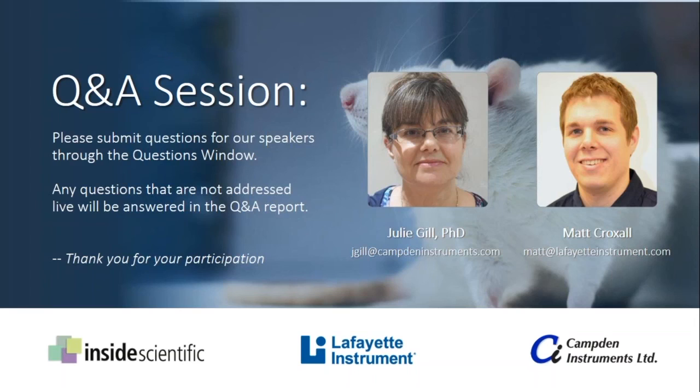Yeah, we've had a number of customers who have added that requirement to their tasks for specific experiments where they required the animal to dwell, just like in a nose poke, for a certain duration. And the software does detect the onset of the touch and the touch up event, or the release of the touch. So in the schedule, you could clearly put in a requirement for the animal to make the initial touch and then stay there or dwell for a variable amount of time before they have to release. So that is certainly doable.